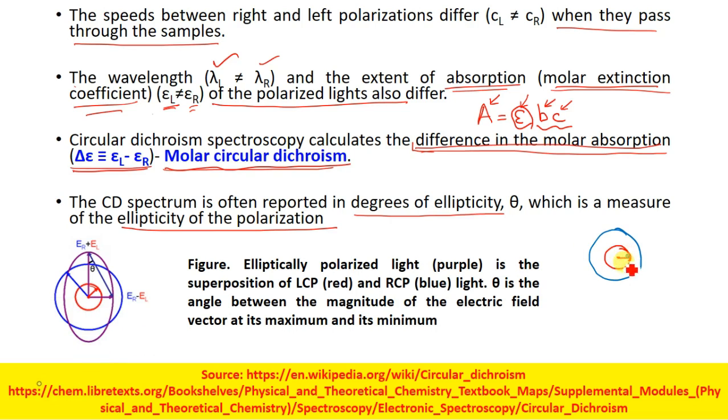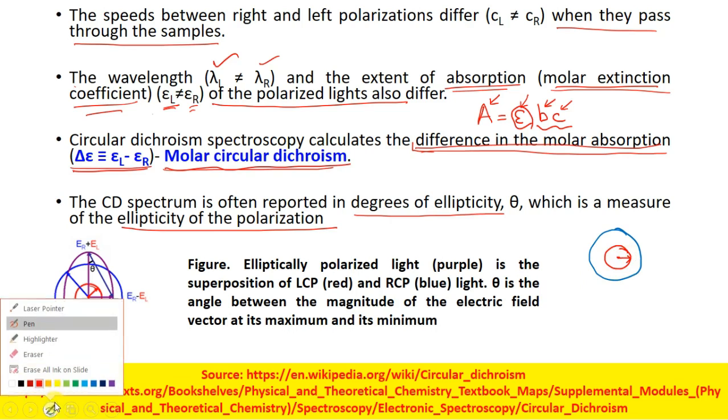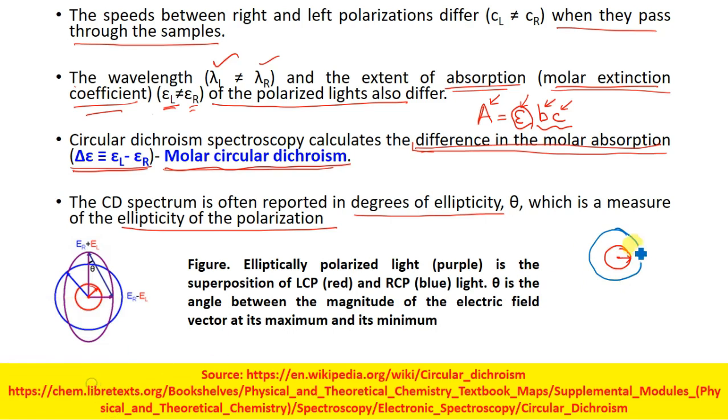It is having an electric field over here, and since they are concentric, the other one will be having its own. Now what you are trying to do is find out, say, ER minus EL. Say for example, at these locations there is a constructive electrical interaction.